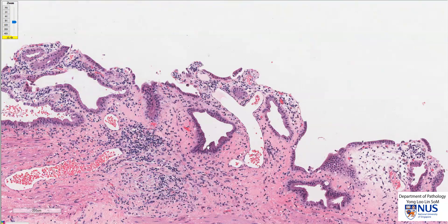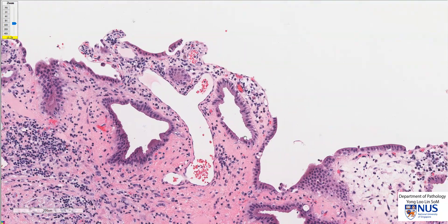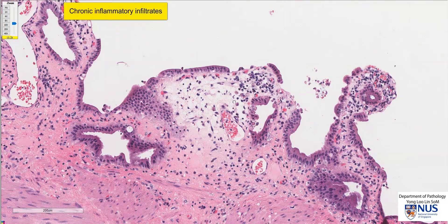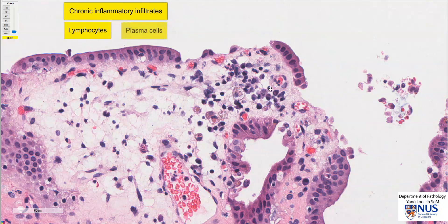Let's take a closer look at the mucosa. We can see that there is a nice arrangement of simple columnar biliary epithelium. Within the lamina propria, there are areas of chronic inflammatory infiltrates, and these include lymphocytes, as you can see here, and also occasional larger plasma cells.